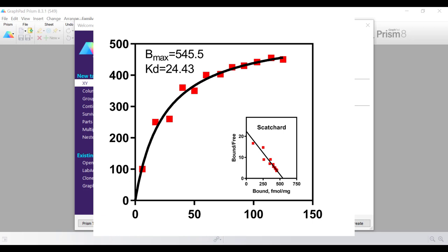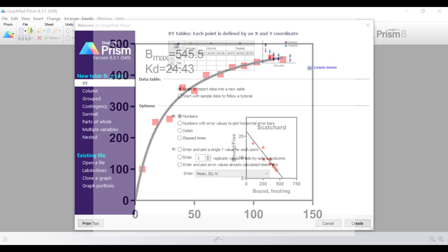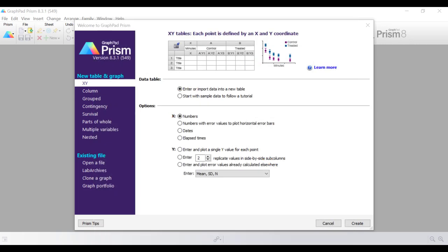Here there are two graphs from a pharmacokinetic experiment. The main graph presents saturation binding data and the smaller graph in the lower right corner presents a Scatchard plot of the same data. Combining graphs in this way can be useful when you want to plot related data onto the same graph. So let's go into Prism and begin the tutorial.